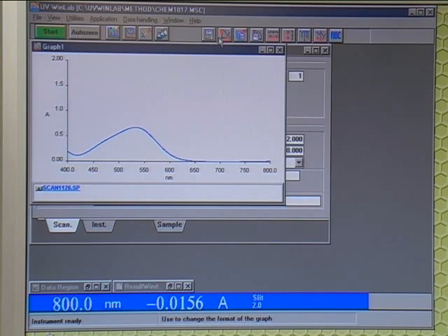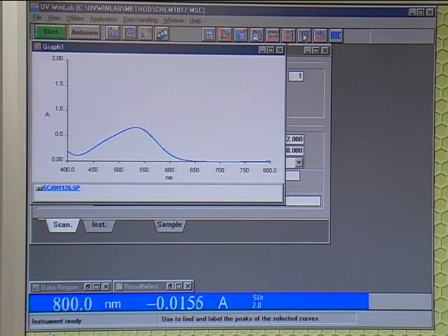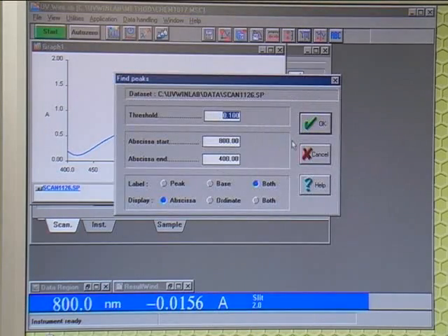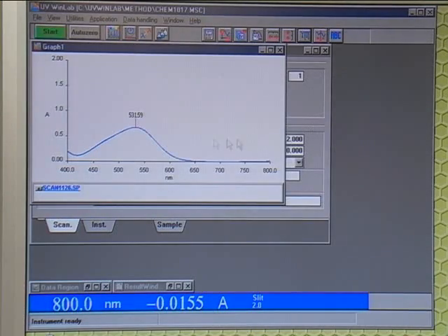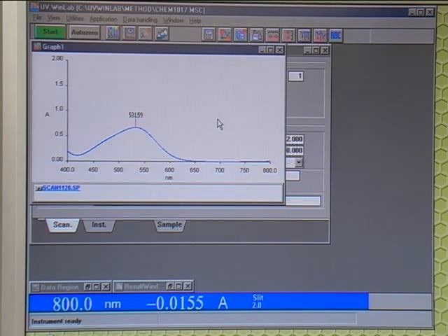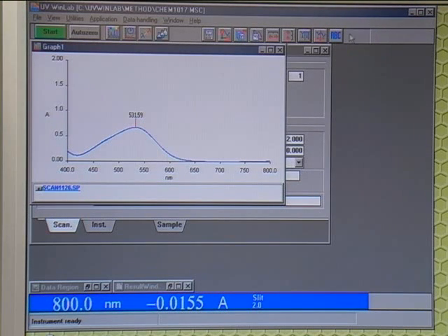Once the data acquisition is finished, add labels using the program, marking the height of the peak and what the substance is.